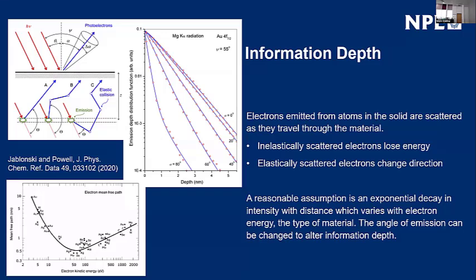Some of these curves that you can see, particularly at the very high emission angles, that's because there's other types of scattering. It's not just the loss of energy. Electrons, if they scatter off atoms, they change direction. When they're losing energy, they're scattering off other electrons. But that exponential decay is the basis of most sorts of analyses where you're trying to get depth information from XPS.